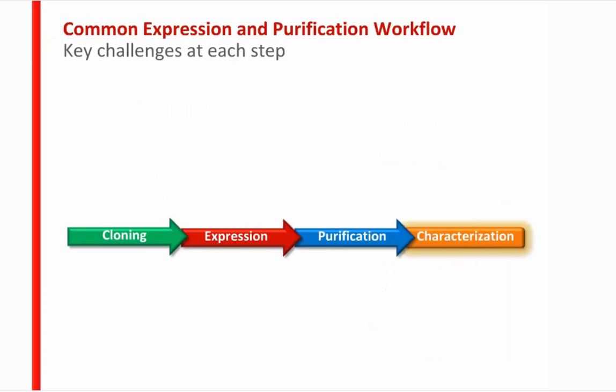So let's jump right in by looking at a fairly common protein expression workflow. And this may not exactly mirror your own workflow, but it's fairly common to start with some sort of cloning or gene synthesis step and then move on into protein expression, followed by purification. And then all of those steps are really just intended to get you down to this end of the workflow, down to characterization and analysis. And that's where you start the next phase of your project, right? So the faster that you get here, the better off you are. You have active soluble protein to work with, and you can start the next phase.